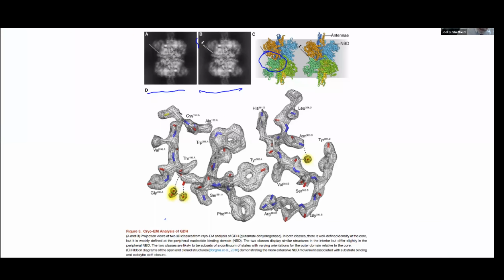And they're actually looking at the level of where they're beginning to say, look, here's the shell of what we think is an amino acid, and that amino acid is tyrosine. And you'll notice they've drawn in a stick figure.